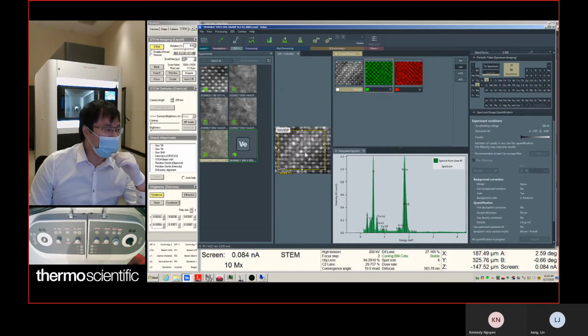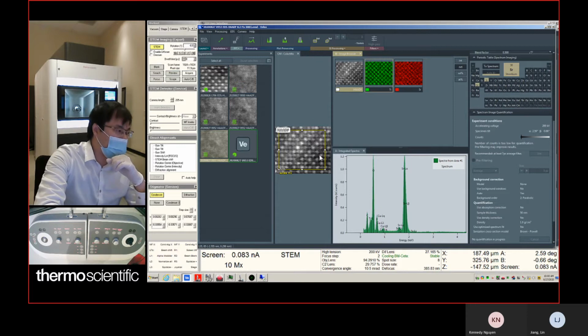The sample is moving a little bit, I think. During the acquisition, you can adjust your focus a little bit, because during the scan it's on autofocus. You can adjust your focus, and it goes a different way.